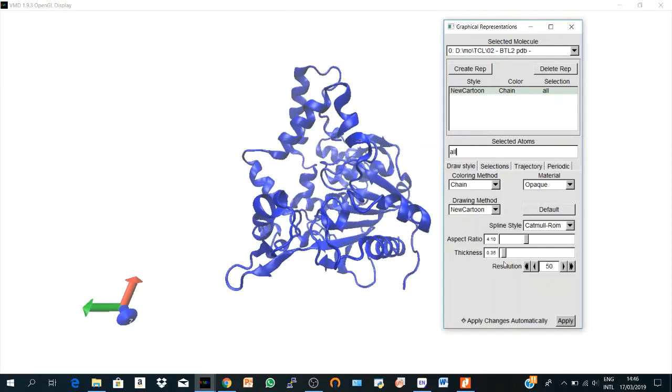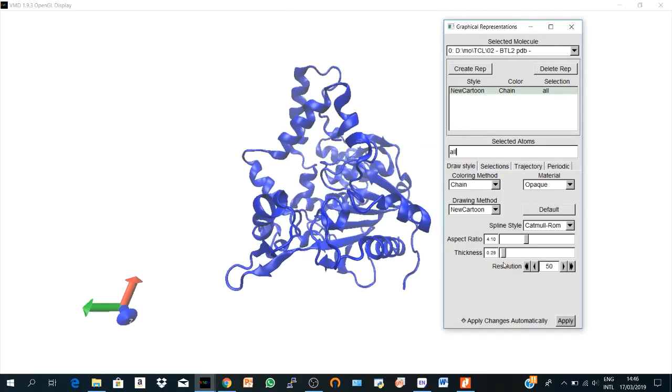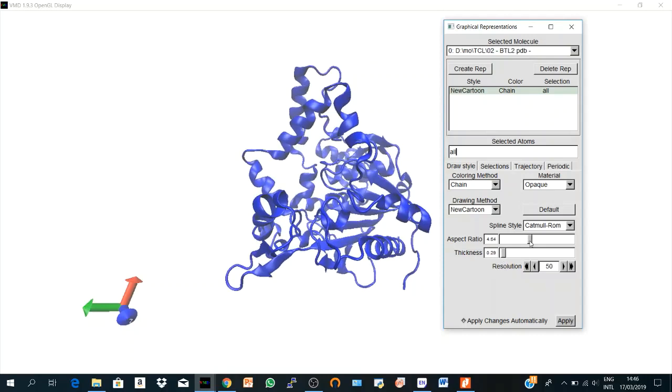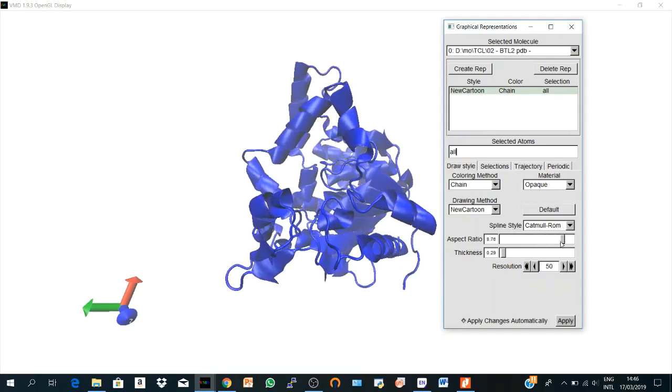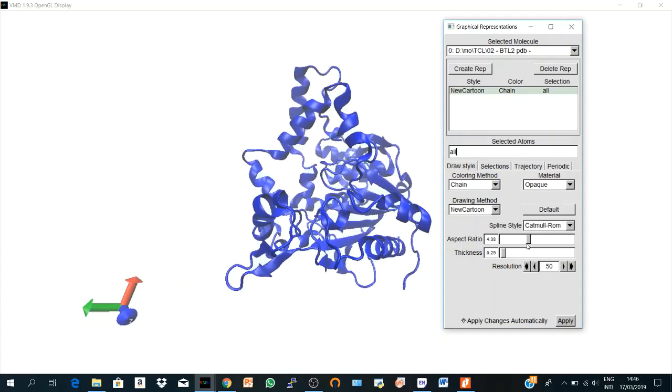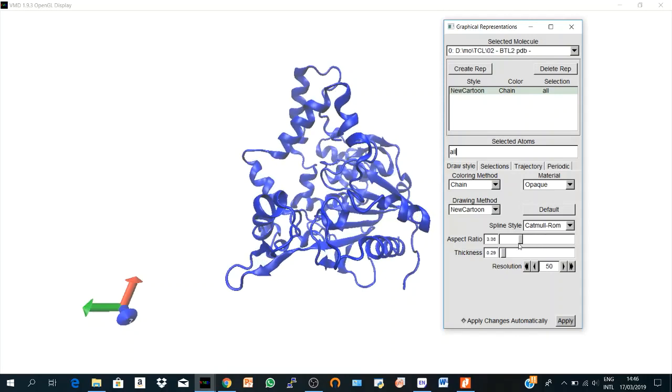So I think 35 is okay. Here is the aspect ratio. You see if I increase it, so it should also be somehow adjusted.